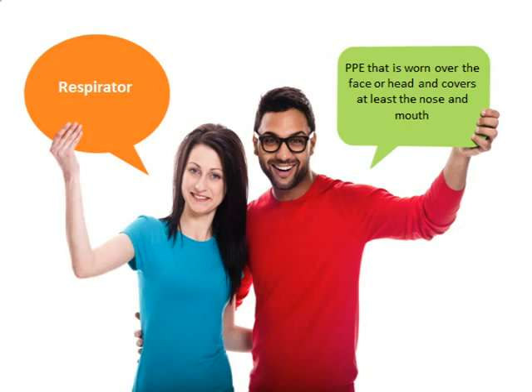A respirator is a type of personal protective equipment that is worn by healthcare workers as well as other workers. Respirators can cover a large part of the face, but at the very least are worn over the nose and mouth. An N95 respirator is used specifically in healthcare to reduce the healthcare worker's risk of inhaling small, hazardous airborne particles. For the purpose of this training, we are going to focus on the use of the N95 respirator.